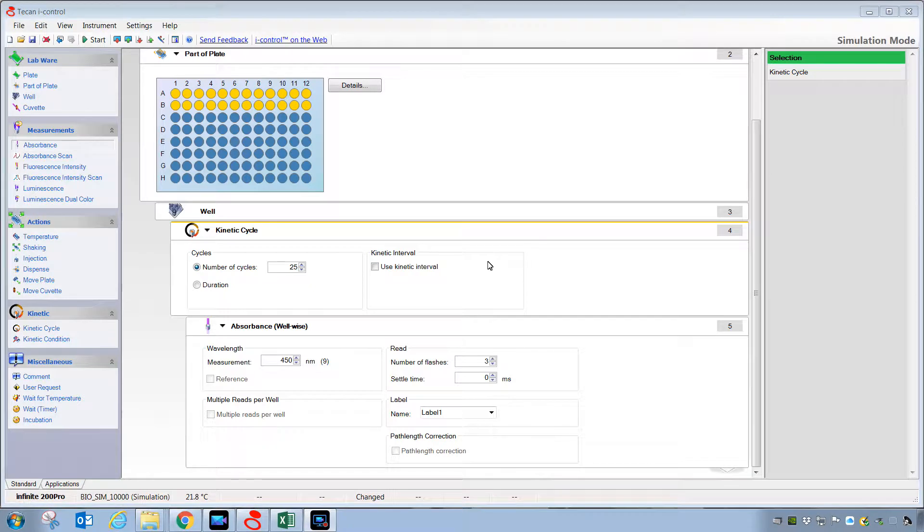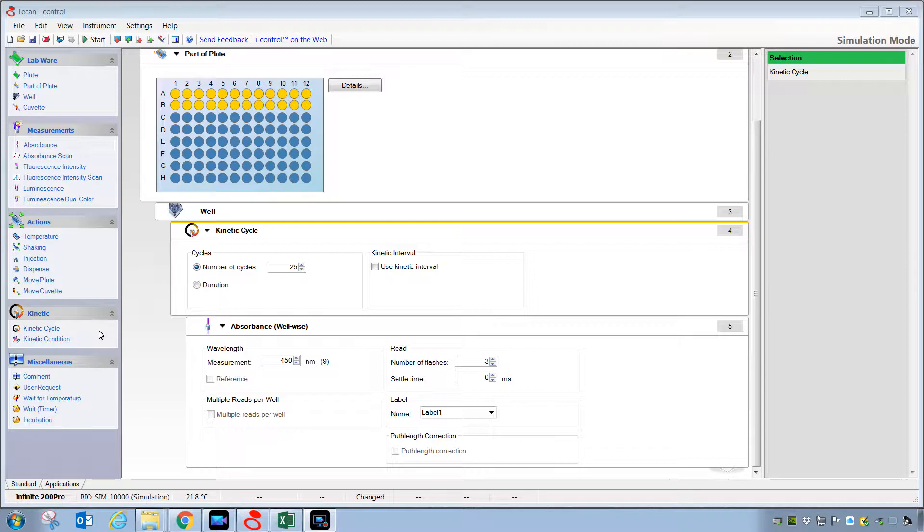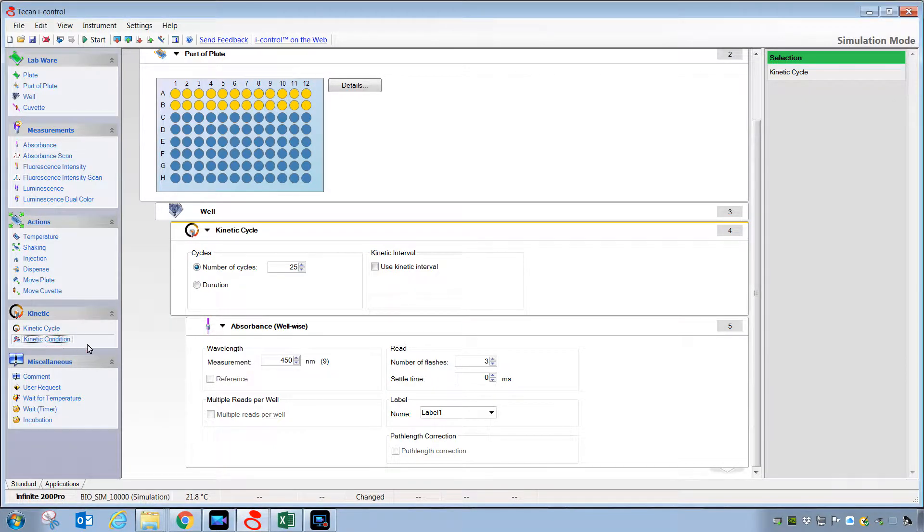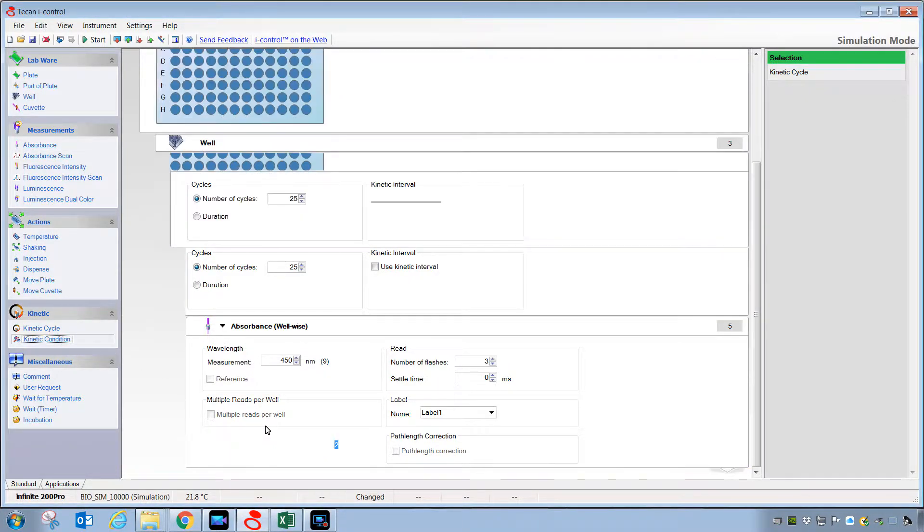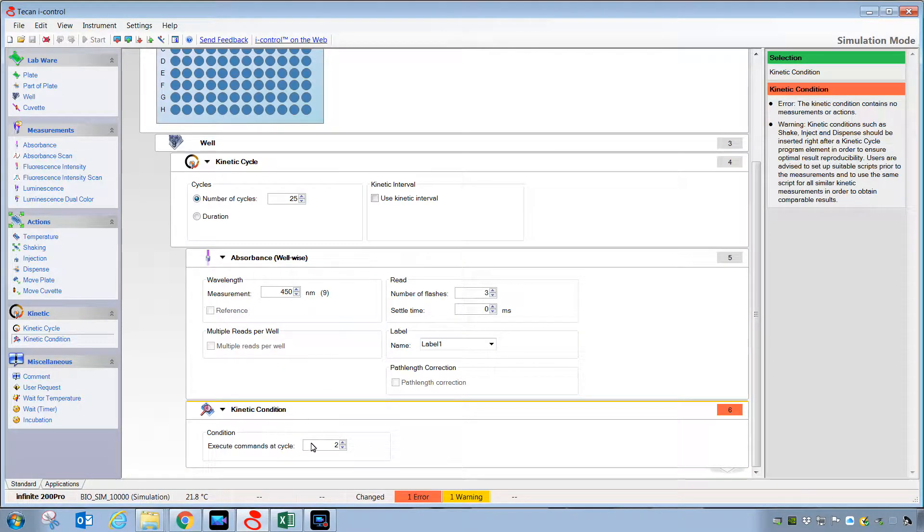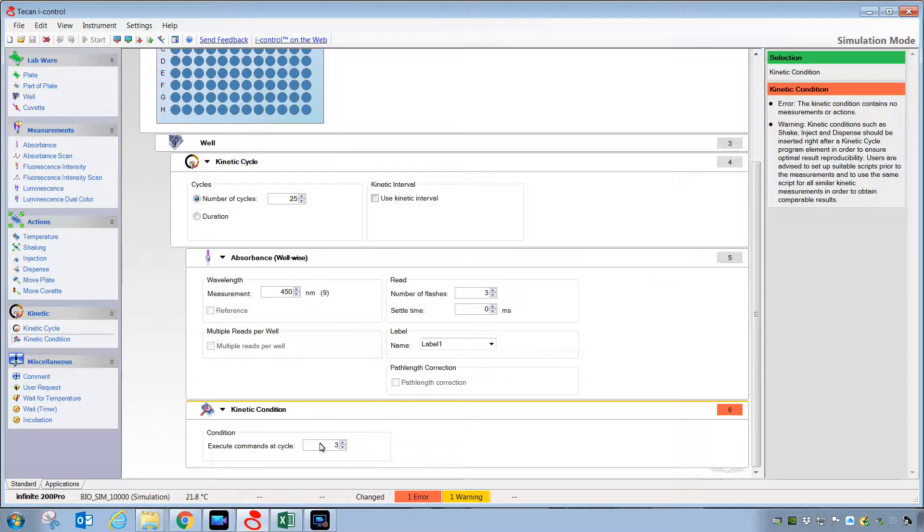If you would like to employ the use of injectors, that is accomplished by inserting a step such as this one called kinetic condition. Let's just say that for the first three readings of the 25 readings, we're going to collect a background reading.